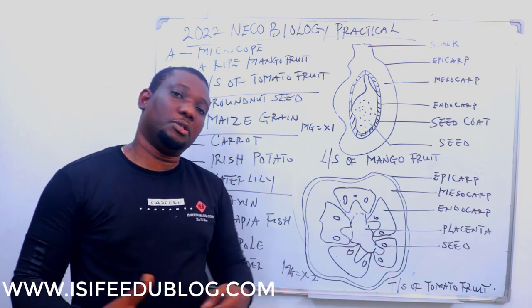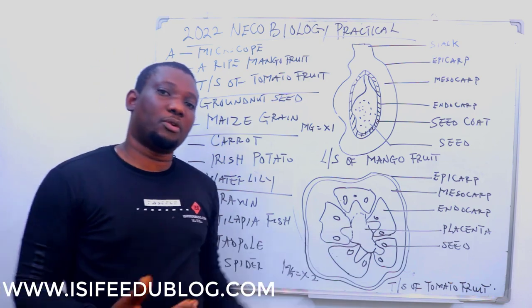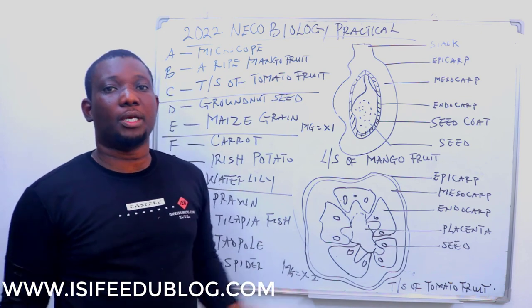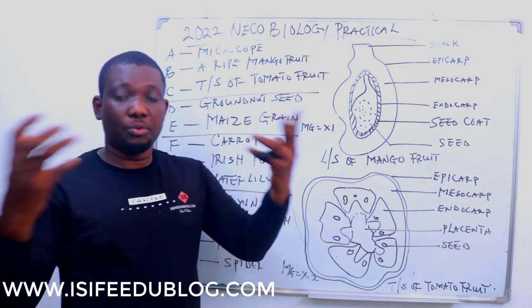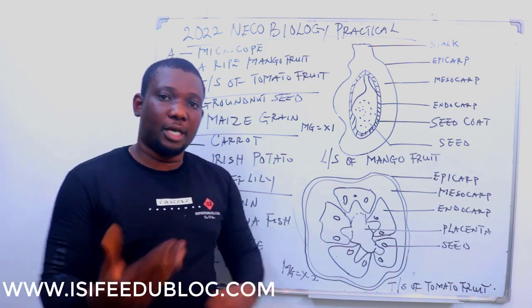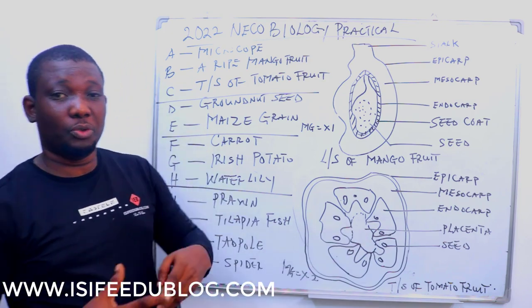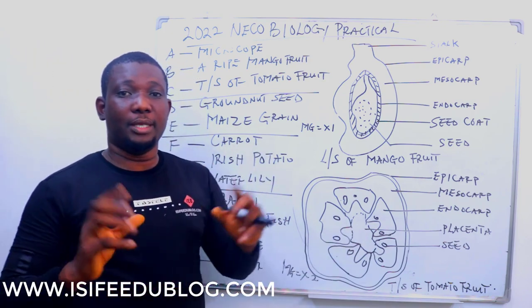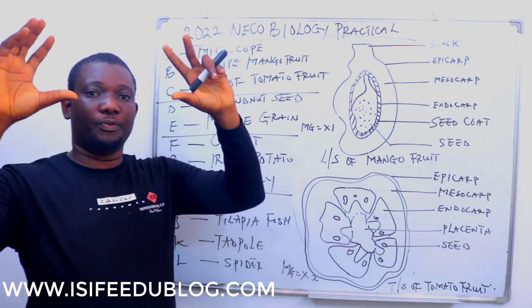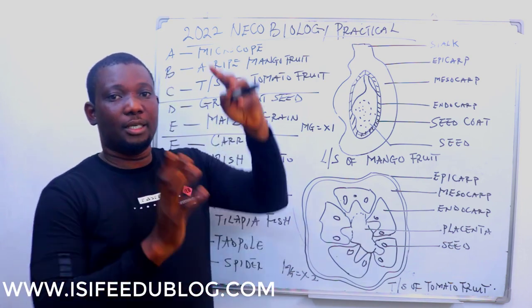Okay. Now the head bears the part called the eyepiece. Yes, the eyepiece is also known as the ocular part of it, the ocular. Some of the microscopes that are simple can come in form of monocular. Monocular means that it doesn't have two eyepieces, just one eyepiece in it, that is for those that are simple. But compound microscope, another form of microscope, like electron microscope, do come with double lenses called binocular microscope. So these are the parts of the microscope at the head region.